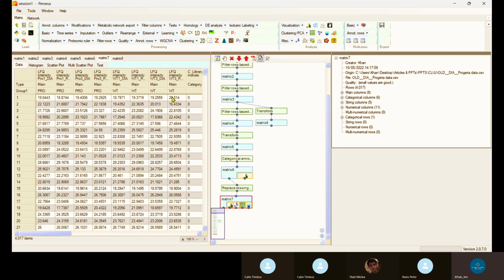If you impute it, then that is a bias. Suppose here in the first column all these are 0, and only 1 or 2 have valid values, but the rest were not detected by the detector. Many authors have suggested that it is better to remove these, otherwise these proteins will create a bias in the data selection, because per the imputation method these values will be filled by some speculative method, but that is not real.